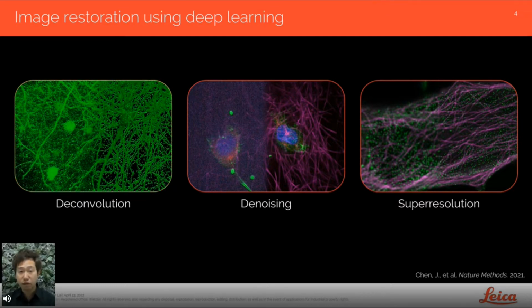So this is about deconvolution. Deconvolution is a computationally intensive process that requires specialized knowledge to recover the original image signal. With deep learning, you can have the computer figure out the optical parameters and the image distortion profiles that are needed to apply the deconvolution.